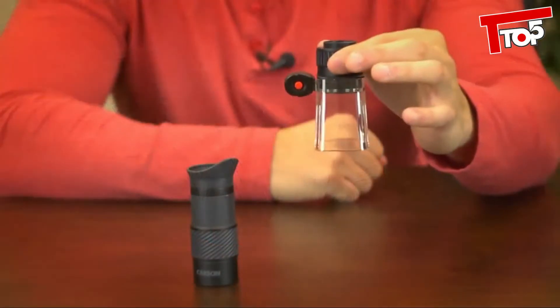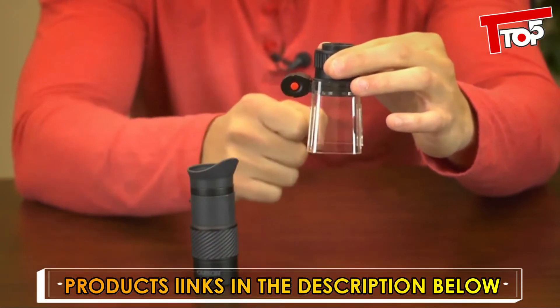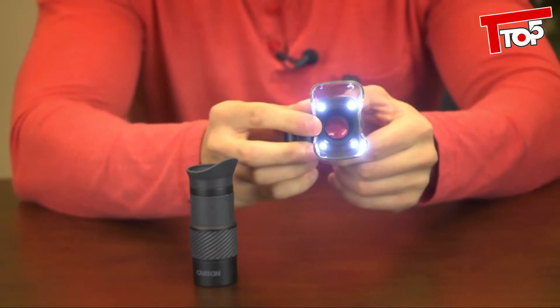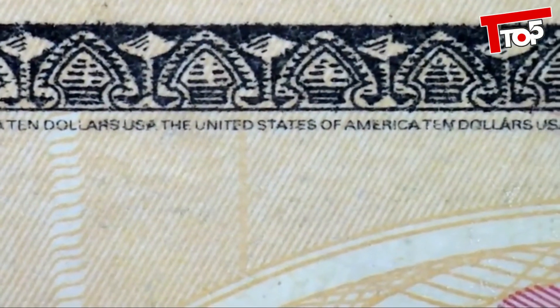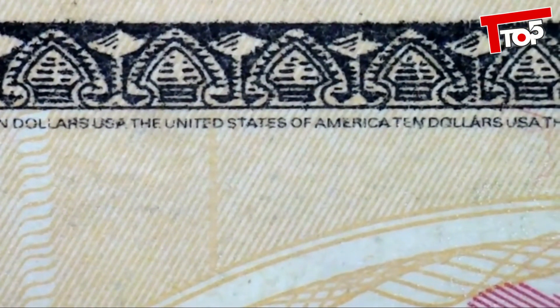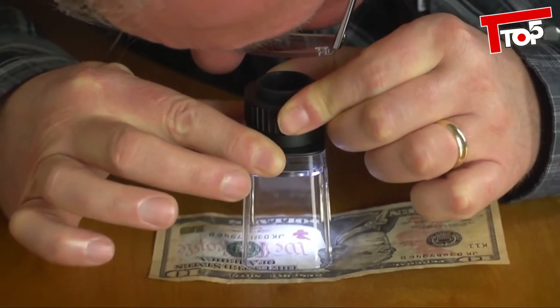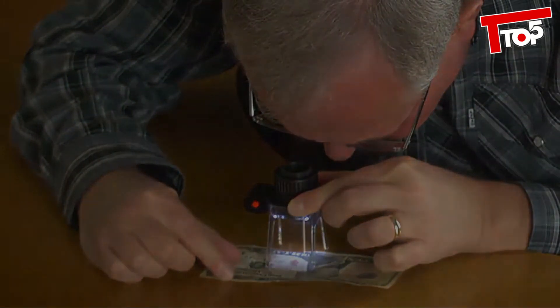Next on this device is the four power eye loop. You're probably wondering what that little red button is attached to the side. Well, if you push it down, you're going to activate four hidden LEDs that are positioned to cover your entire surface area without getting any of those annoying shadows or dark spots. Just like the monocular, this device is completely focusable, and we've even attached a neat clear stand.